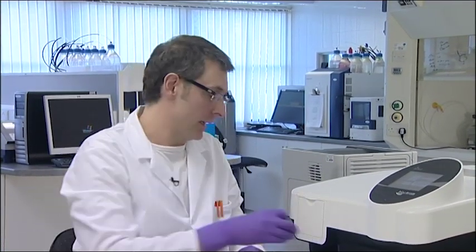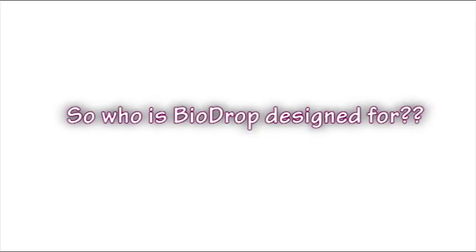Hi, I'm Dr. Steve Church and this is Biodrop. Biodrop is a revolutionary yet affordable product for low volume UV visible spectroscopy. Biodrop is ideal for those performing UV visible spectroscopy on DNA, RNA or protein. It's also ideal for those with highly absorbing samples, as Biodrop's unique design allows maximum light through the sample.